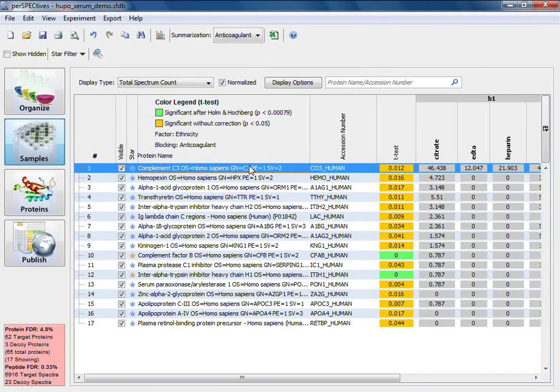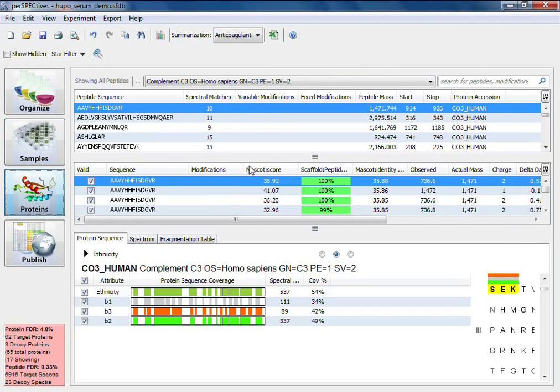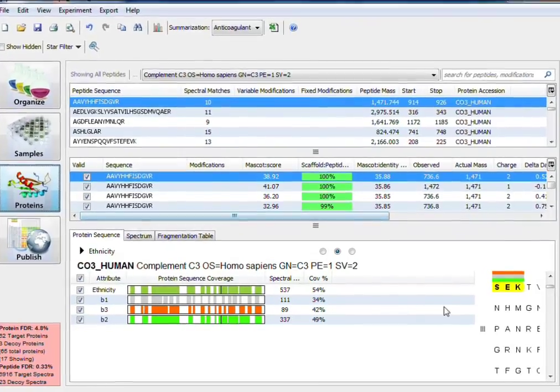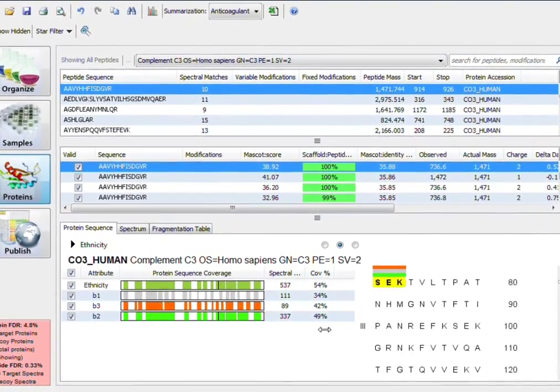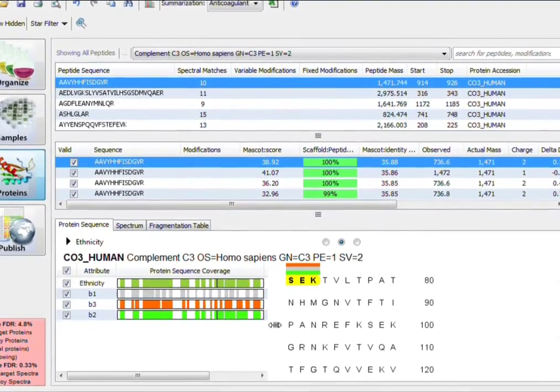Once you identify the most useful proteins in your experiment, you can look at them more closely in the proteins view to validate the results.